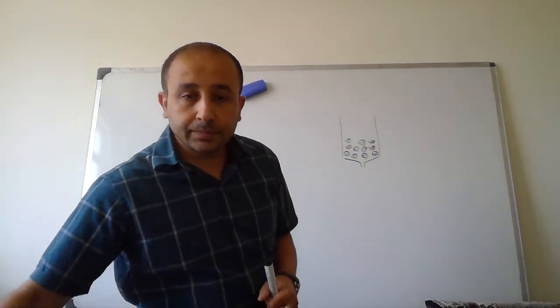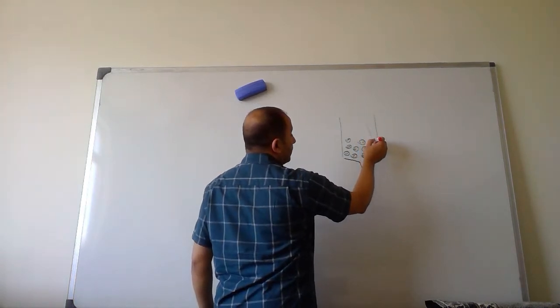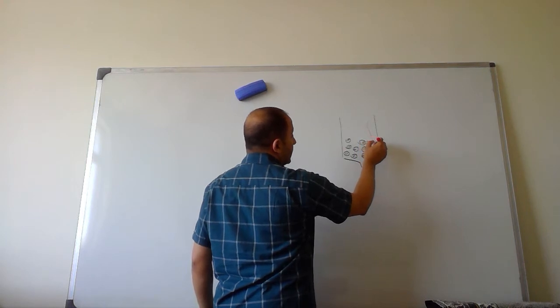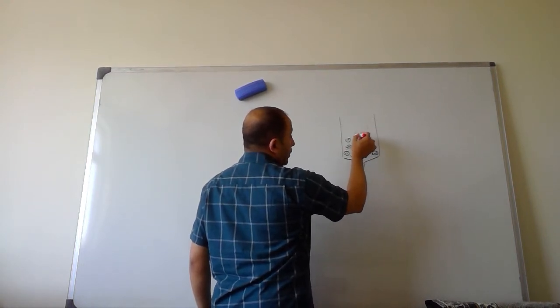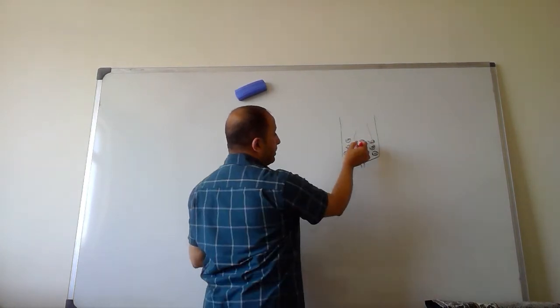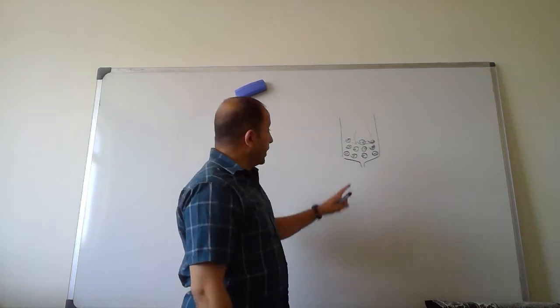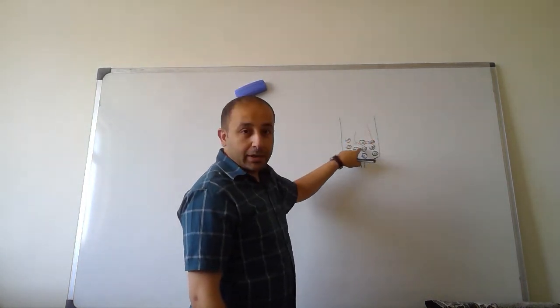allow small molecules to go through them, but not large molecules. Some of these molecules will go directly through the interparticulate pathway. As we see here, we have particles, so the movement can be interparticulate and intraparticulate.